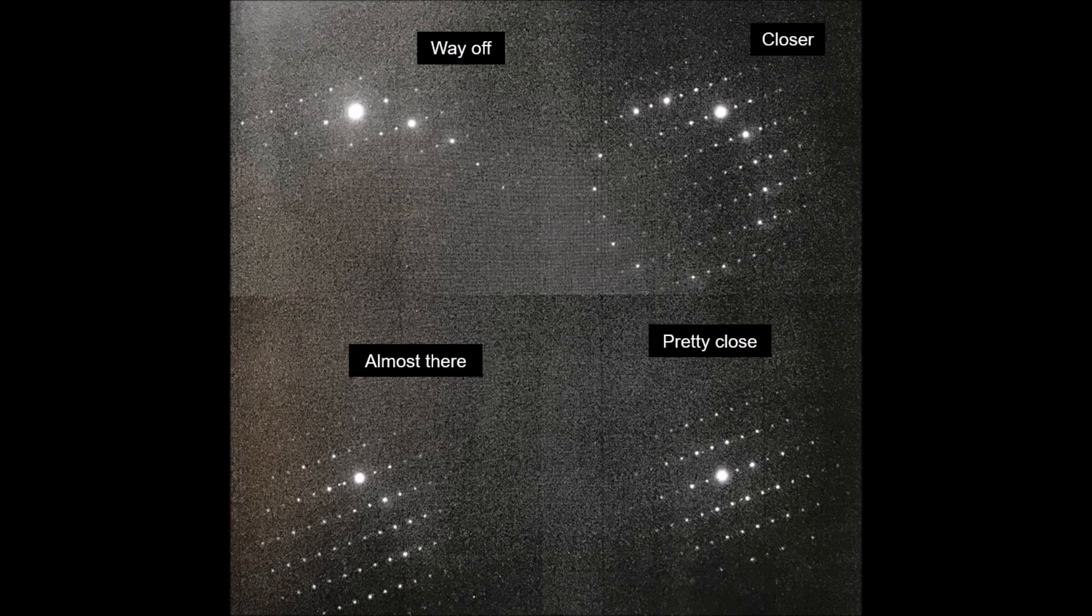Although if you look closely in that image on the lower right, you will see that we're still not quite there because I can still see some instances where a spot and its opposite don't have the same intensity. So the lower right, we are still actually noticeably off from the zone axis, although not nearly as badly as we were when we started in the upper left.